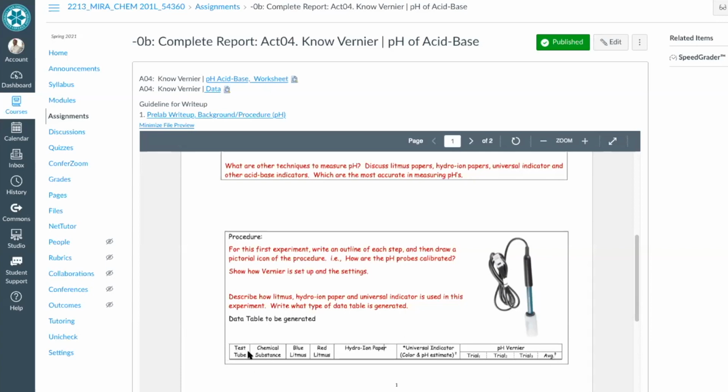You guys have test solutions. You've got chemical substances, test solutions like 1, 2, 3, 4, 5. Chemical substances like vinegar, ammonia, 7-Up, things like that. Then you're testing it with red litmus and blue litmus. If you watch the video, I actually show you those results in the video. You're testing it with hydrion paper. What is the color of the hydrion paper, and what is the reading based on that color?